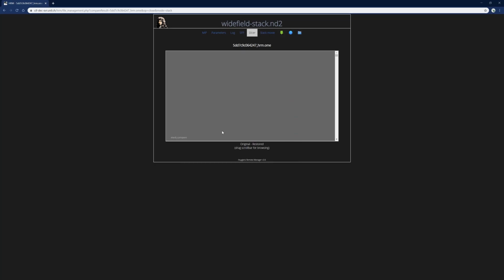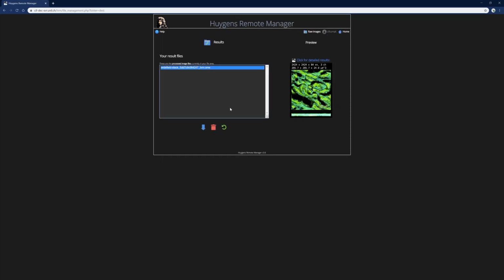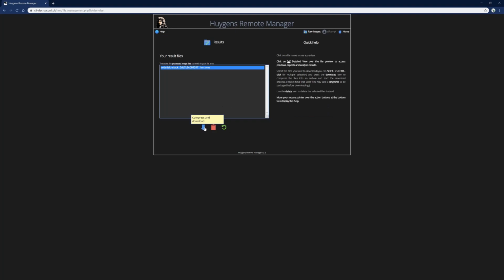So if you're satisfied with the results, you can pack and download everything by clicking here on the green arrow. And if you are just interested in the file itself, in the result itself, you can go back here, select the file, and download the results. Here, confirm, and you download.